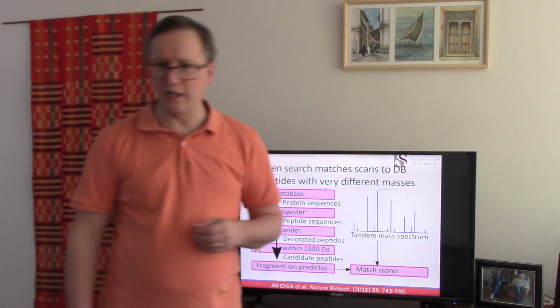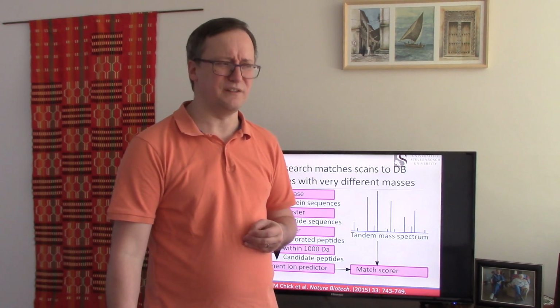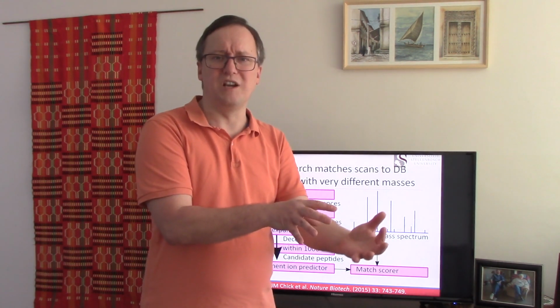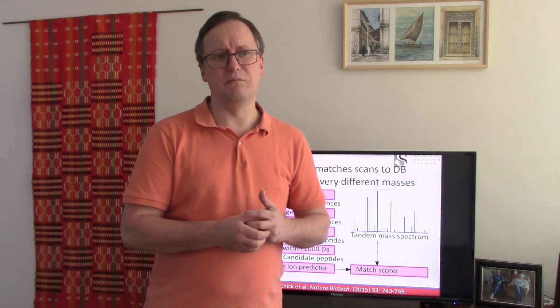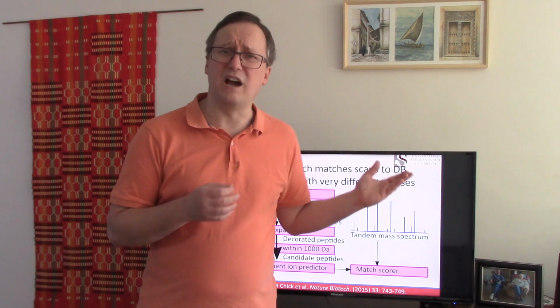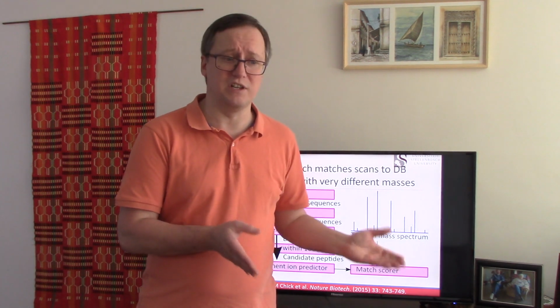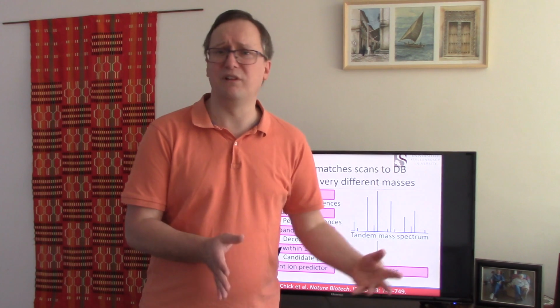In the end, a lot of people found that sequence tagging was just different enough that it was really difficult for them to understand how the results from sequence tagging could be turned into better database searches. Most people feel very comfortable in the database search paradigm, and thus sequence tagging largely fizzled out. There are a lot of papers published in the space, and the labs that have developed them still find it a very useful technique, but I think a lot of people have found it so different that they don't know how to interpret it.